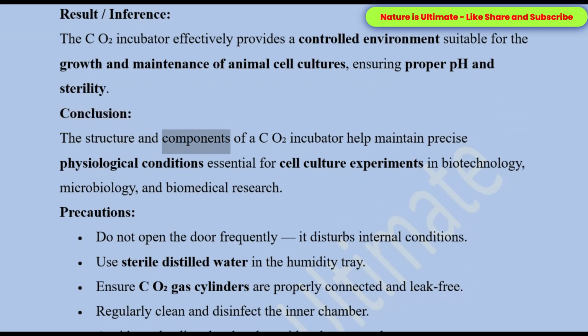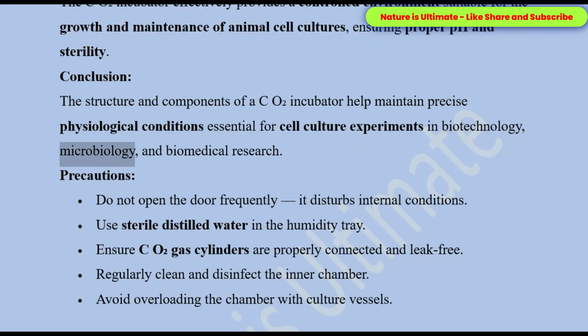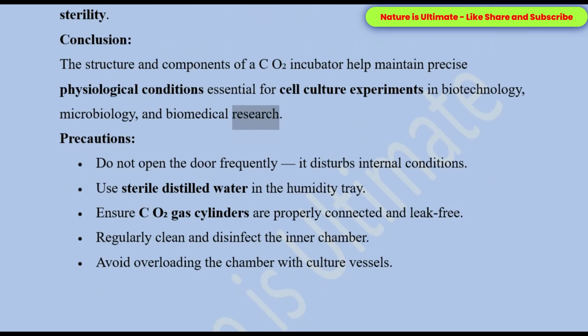The structure and components of a CO₂ incubator help maintain precise physiological conditions essential for cell culture experiments in biotechnology, microbiology, and biomedical research. Precautions. Do not open the door frequently, it disturbs internal conditions.